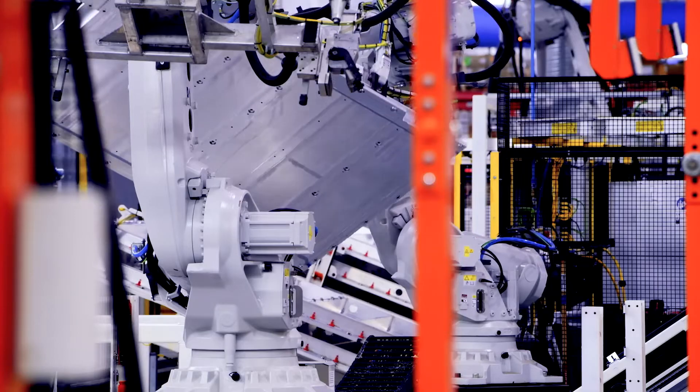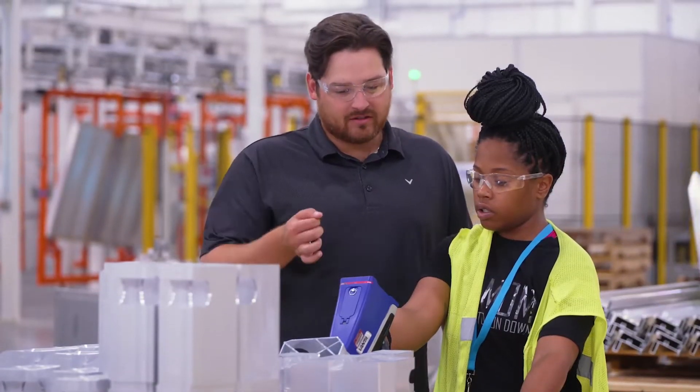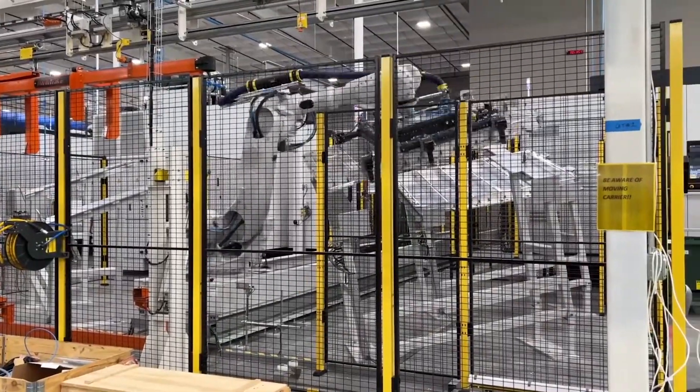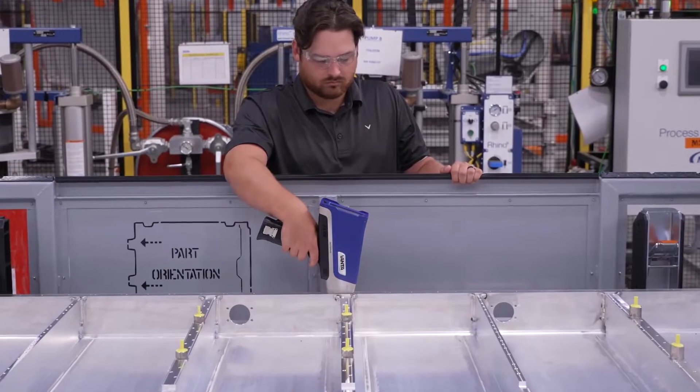Our quality is extremely important to us. We use the Vanta XRF to help ensure that our quality to our customers is up to par. XRF tests for certain alloys or elements in parts. Our suppliers require a range of titanium and silicon, and our Vanta XRF solidifies that we're actually in that range.